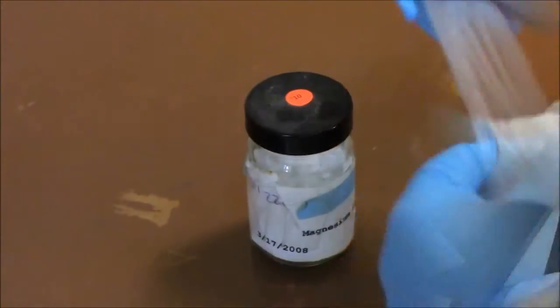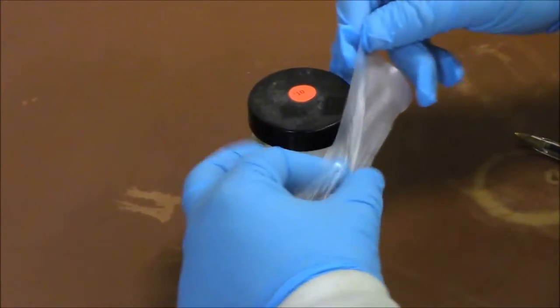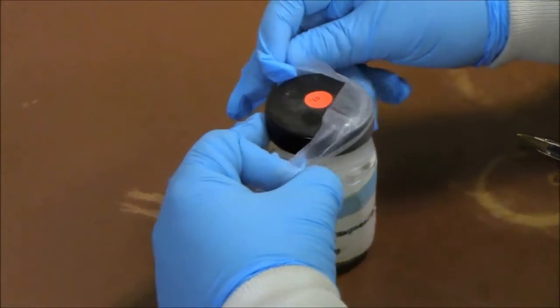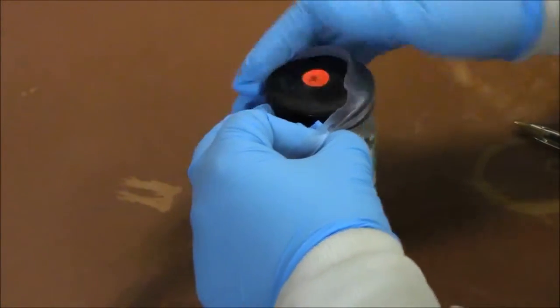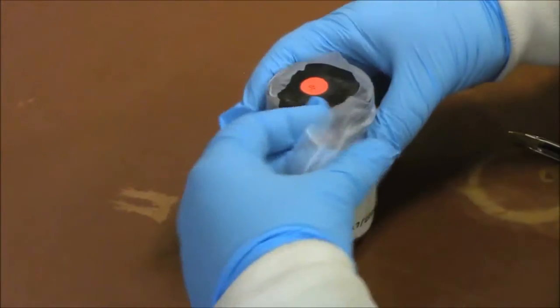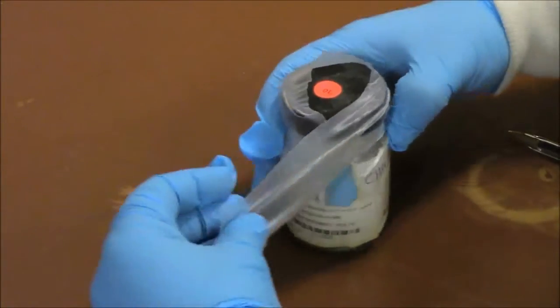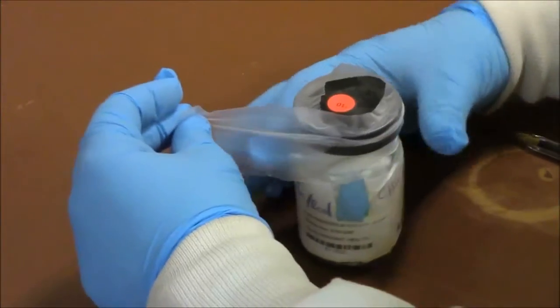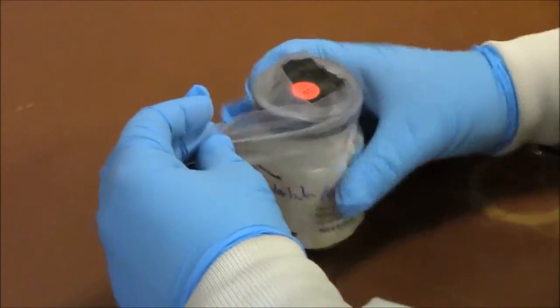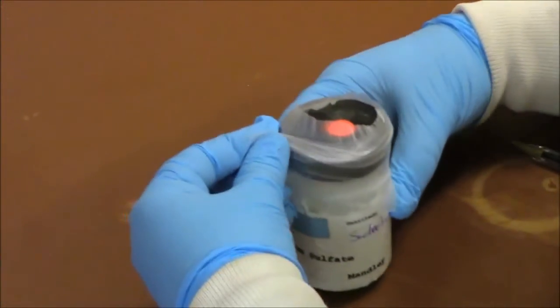Now before you store the chemical, be sure to parafilm the top. This way when it is being stored, it will not leak and it will be safer for everyone involved.